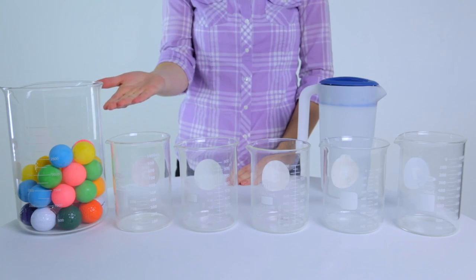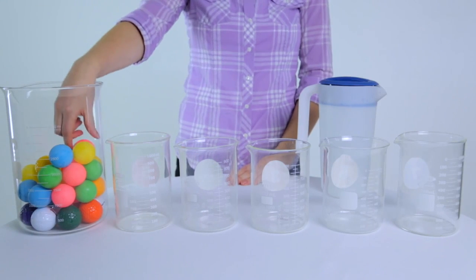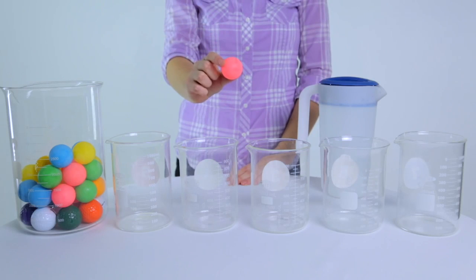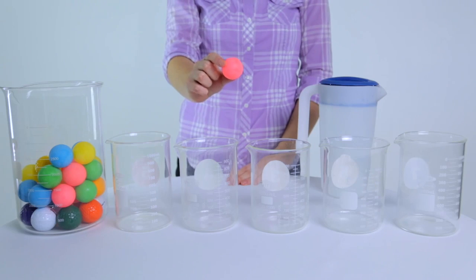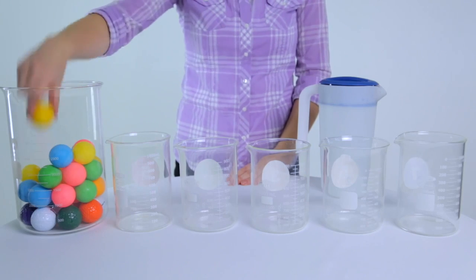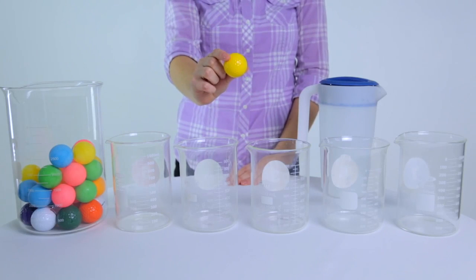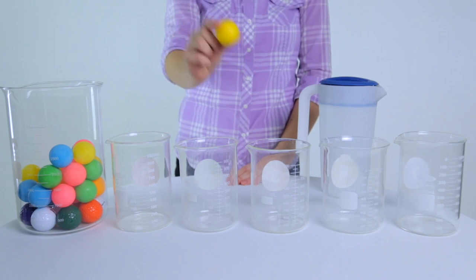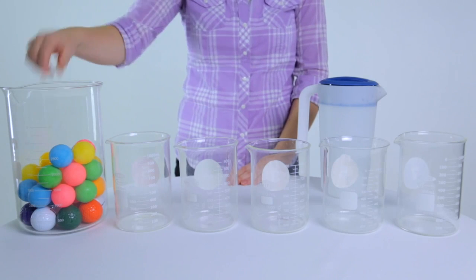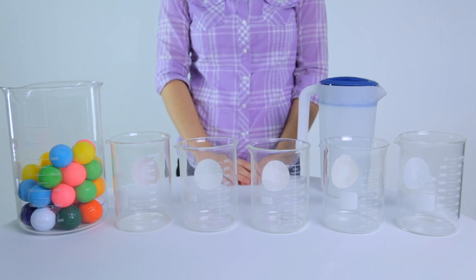Here is a beaker full of golf and ping pong balls that together represent the raw plant material. Each colored ping pong ball represents a different volatile aromatic compound. The golf balls represent other compounds found in the plant material that are structurally too large or heavy to be collected by steam distillation and will not be found in the essential oil.